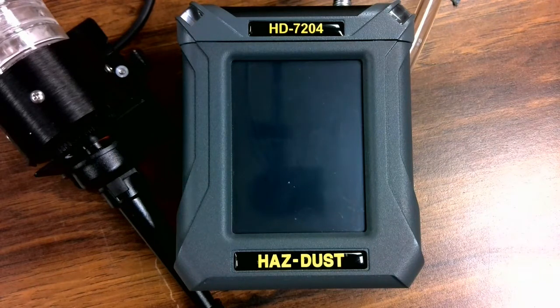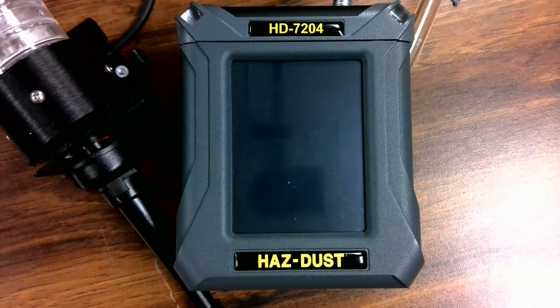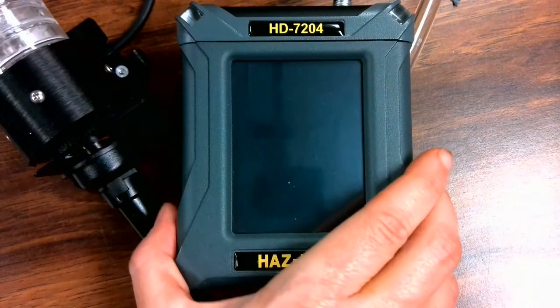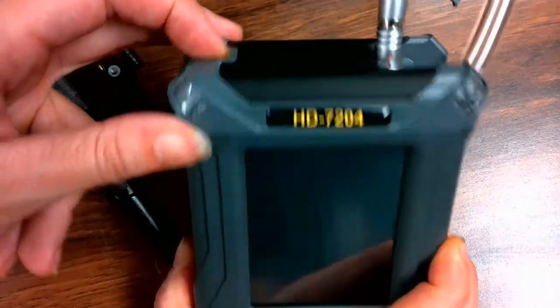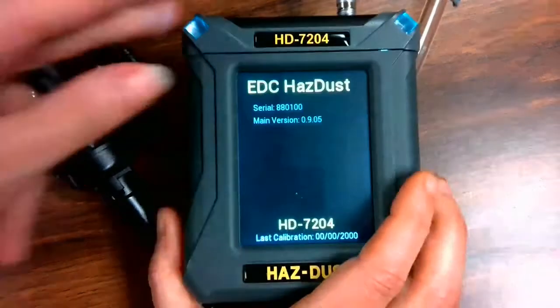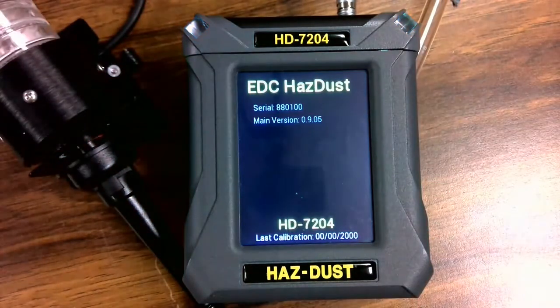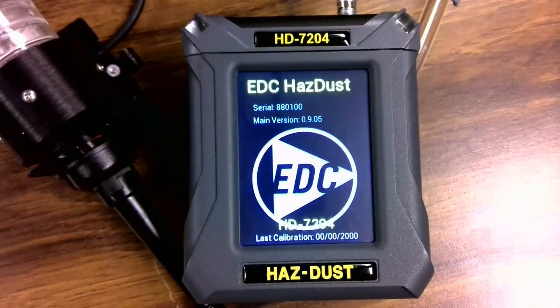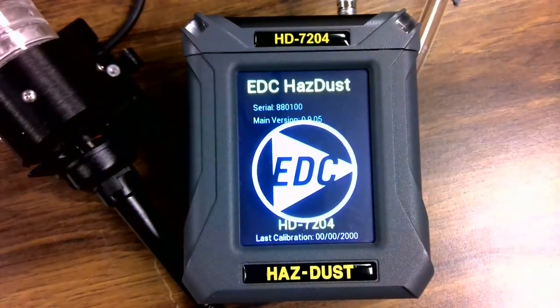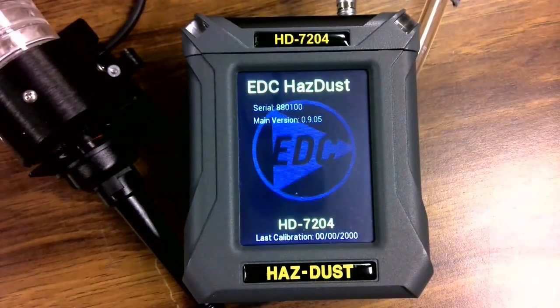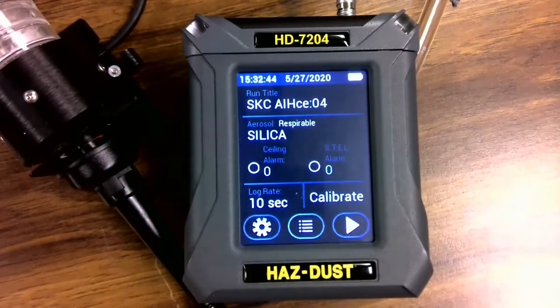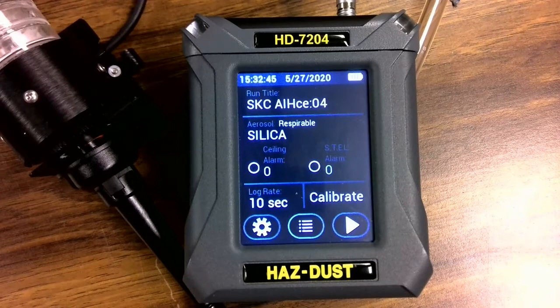To power on, press the yellow button at the top of the instrument. Upon powering, the flash screen will appear. The flash screen will display the manufacturer, model, serial number, and last calibrated date.